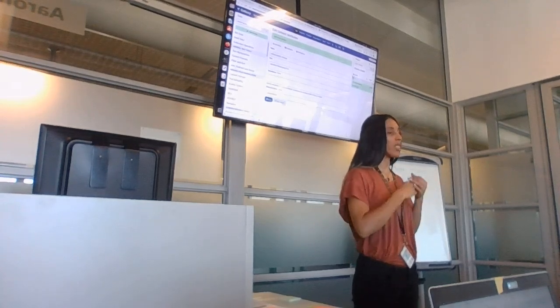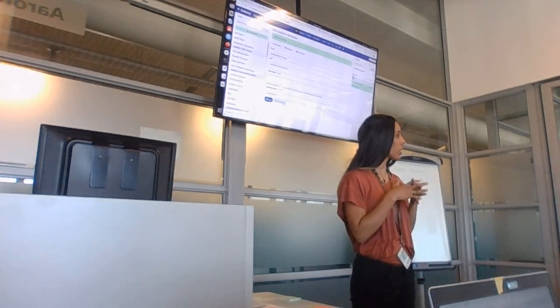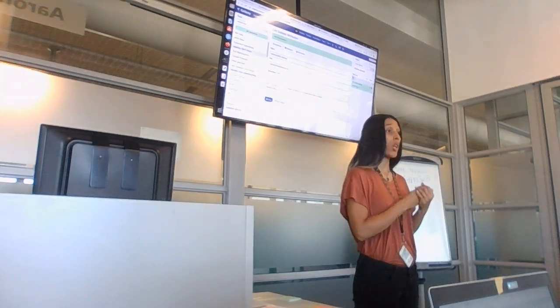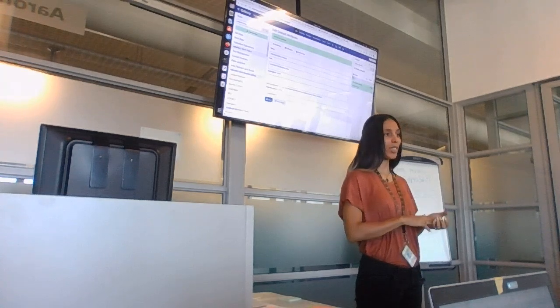And you're going to run that, but this is just for hobby, right? So you've got all of your stuff in place. Would you create a workflow for that? What even is a workflow? Maybe we should start there.